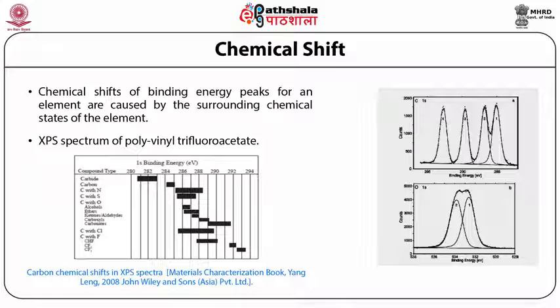Higher chemical shifts occur for a larger number of electrons transferred. Chemical shifts decrease with increasing atomic number and suggest less possibility in metallic and semiconducting elements. For example, the shift range for silicon 2p is less than 6 electron volts.